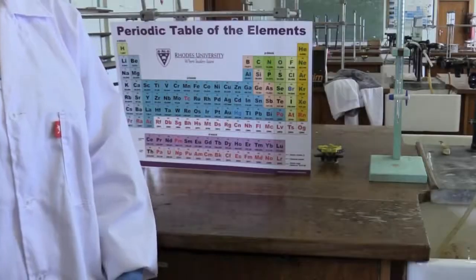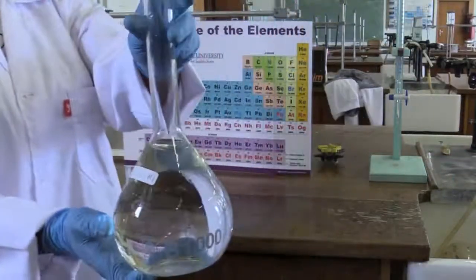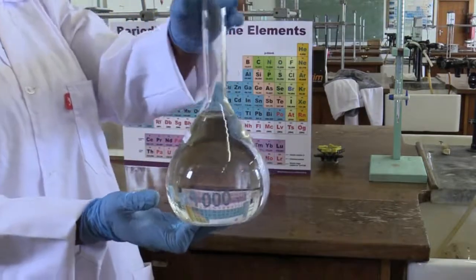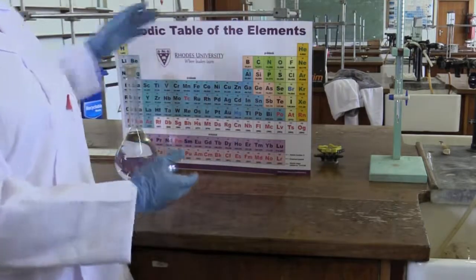Moving on to the equipment needed for titrations. Firstly, we have the volumetric flask containing our standard solution of hydrochloric acid. It is the titrant because we know its concentration, and we will be using it to find the concentration of our analyte.